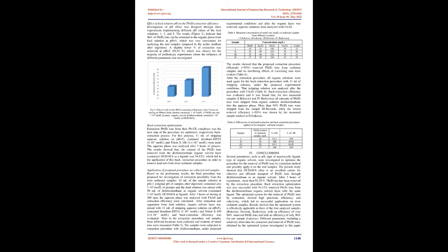Effect of organic solvent volume. In preliminary experiments, different volumes of organic solvent, chloroform, were applied, and the results showed that a 1:5 volume ratio for aqueous to organic phase was optimal for future investigation. Table 3. Effect of macrocyclic ligand type.